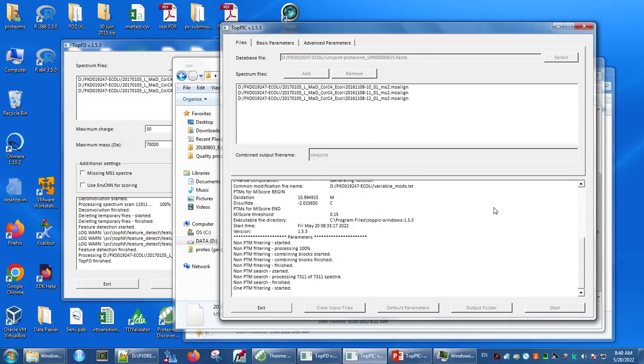In a case like that, we have 4 different searches to perform. We have the intact sequence plus or minus initial methionine. We have the prefix search where we're chopping things only off the C-terminus, the suffix search where we're chopping things only off the N-terminus, and the double cut search where we're cutting things off of both. All 4 of those searches happen in TopPIC automatically.